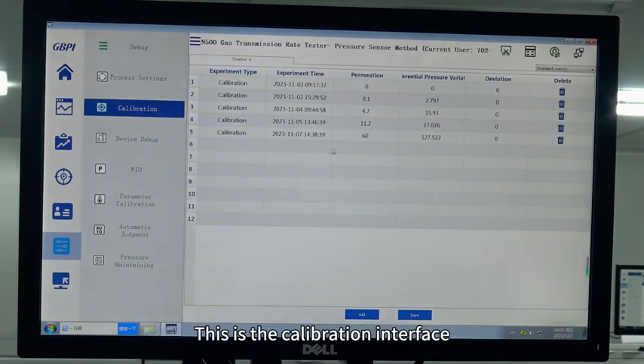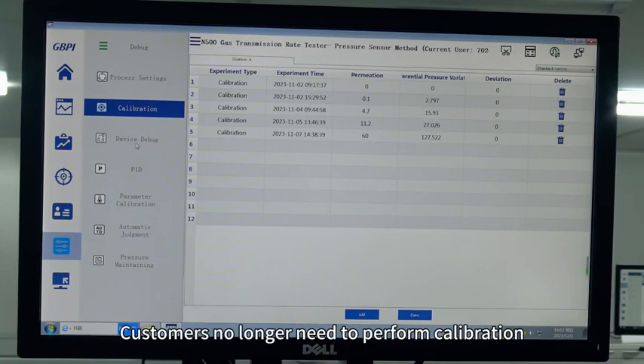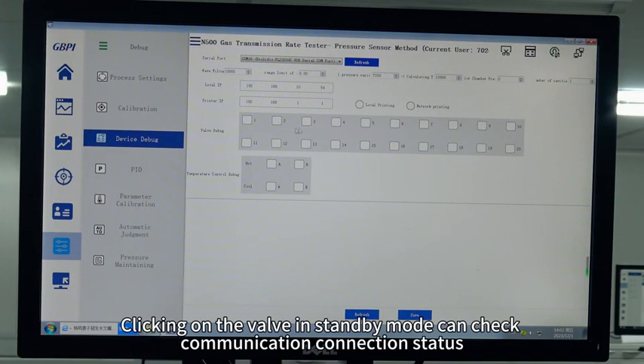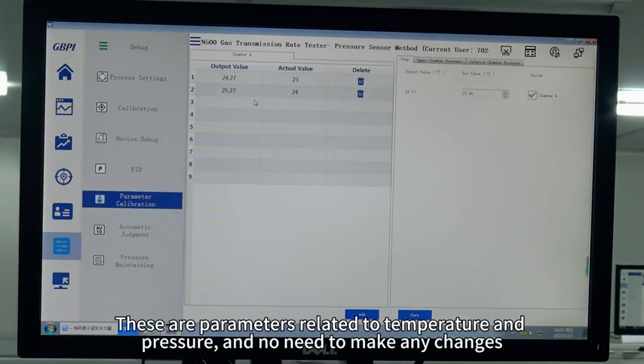This is the calibration interface. The instruments are calibrated before leaving the factory, so customers no longer need to perform calibration. Here is the debug interface — clicking on the valve in standby mode can check the communication connection status. These parameters related to temperature and pressure do not need any changes.